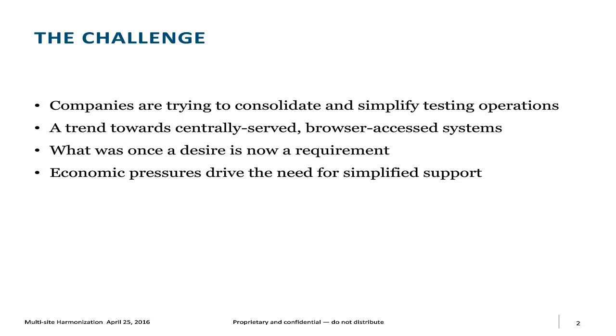And the companies that supplied them early on, Beckman, VG, P.E. Nelson, and so forth, Perkin-Elmer, figured that if they supplied the ability to acquire and process data from their instrumentation, it would draw people to buy more instrumentation. Then over the years, we started to see vendors appear that were pure play LIMS vendors that had nothing to do with instrumentation. But all those systems were based as client-server systems over the years.